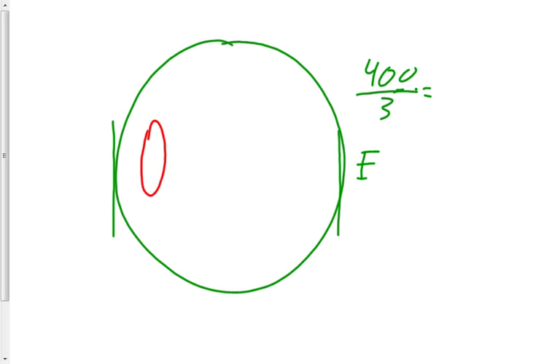So if you have something that's very oblong, like this, or like a paramecium, which is one of the things you're going to look at today, you always measure it on its longest dimension. Obviously, if I measure it along here, I would say that object's maybe only about 50 micrometers, because a lot of them would fit across oriented that way. But we always measure on their longest axis. Not that you could do that on the microscope, but it gives you some idea of what to do.